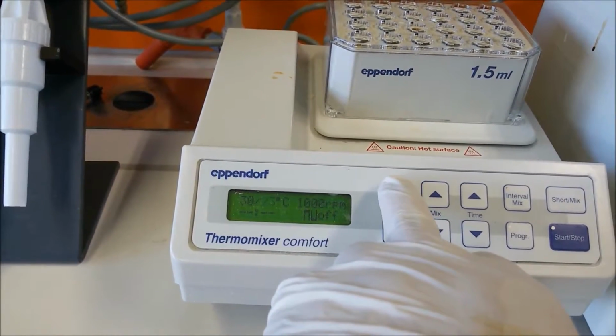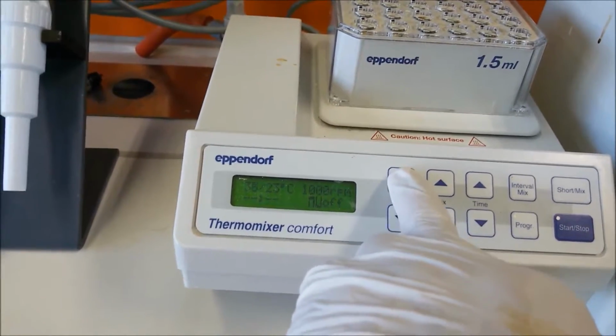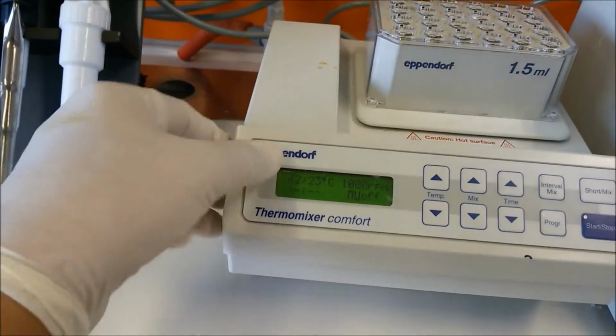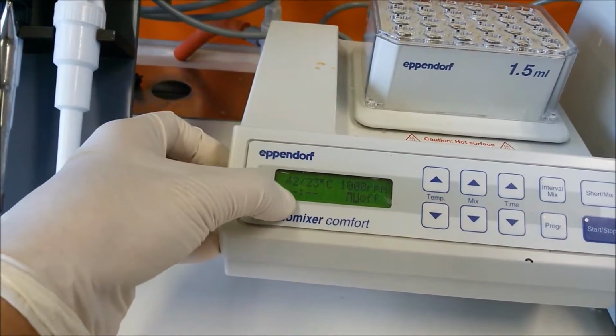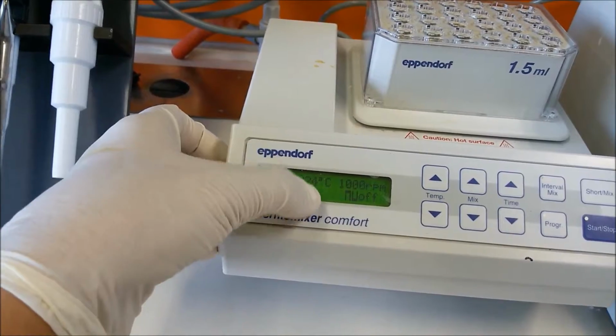So just remember, for example, if you want to do any reaction at a particular temperature, we will go there, we will set this at 42. So this will show you the set temperature, this will show you the actual temperature. So right now it was at 23 degrees, but we set 42, so now it will slowly heat up, and then see, it's 24, so it will reach 42.